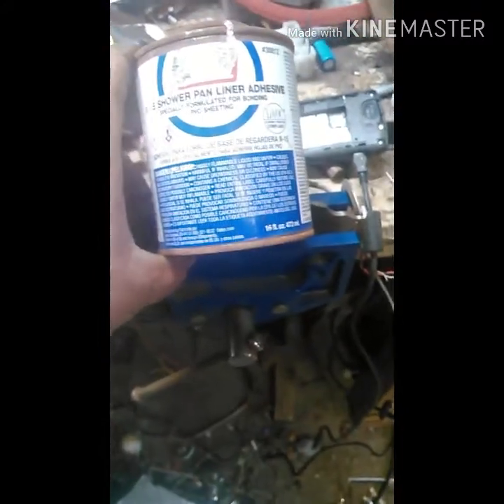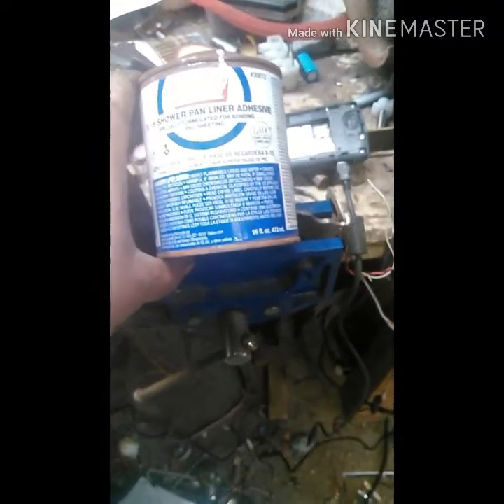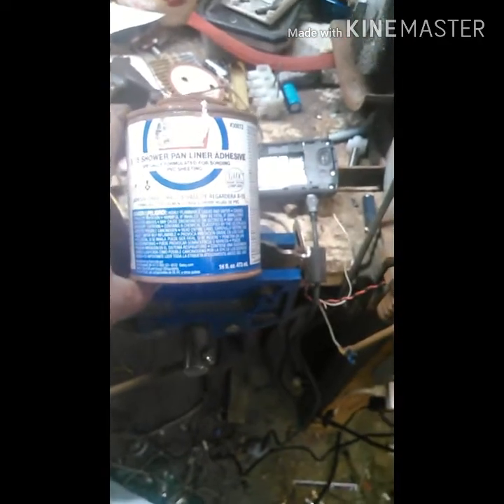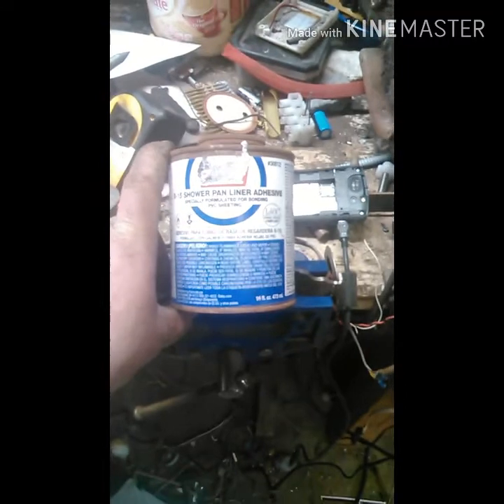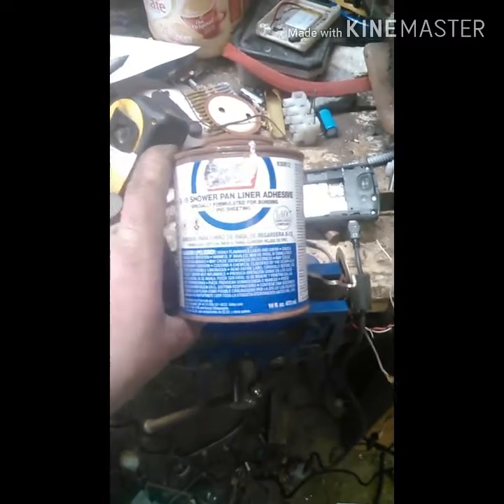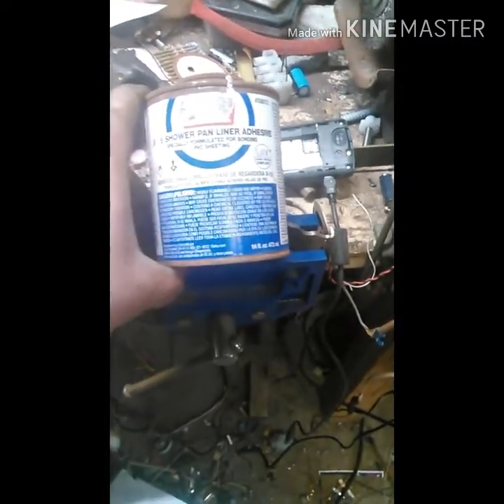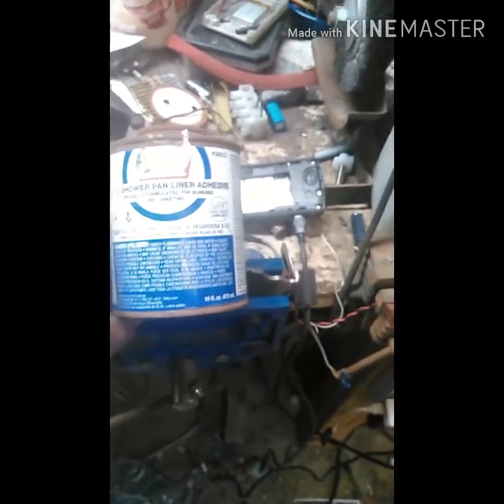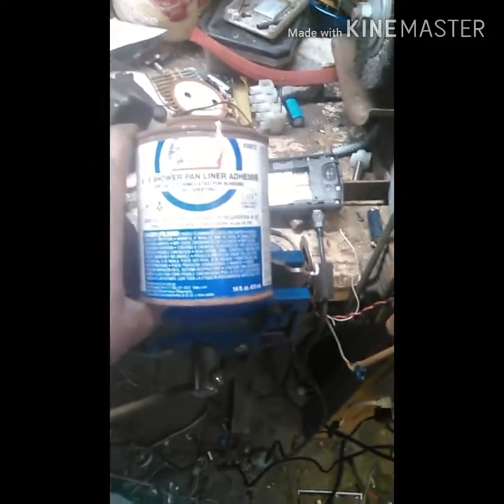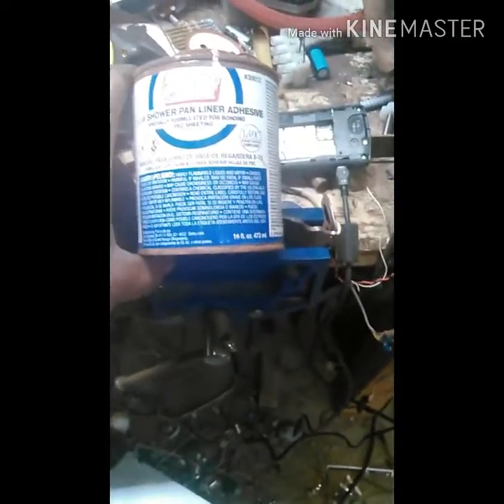It's actually separating these two, because tetrahydrofuran and acetone together make a minimum azeotrope. A minimum azeotrope is when you combine two things and their combined boiling point is lower than either one alone. Pretend tetrahydrofuran's boiling point is 150 and acetone's is 160 — when combined they'd be 130. That's what a minimum azeotrope is.